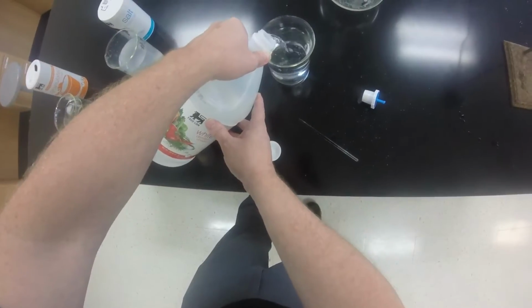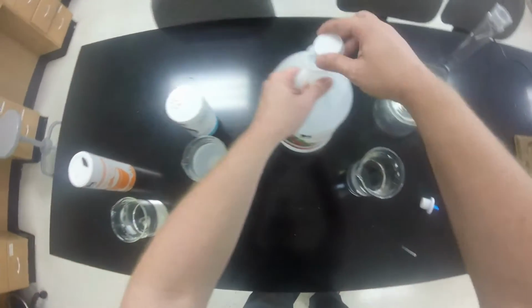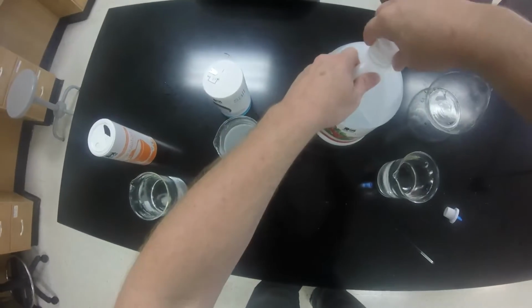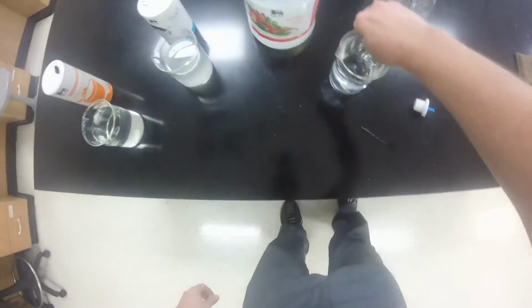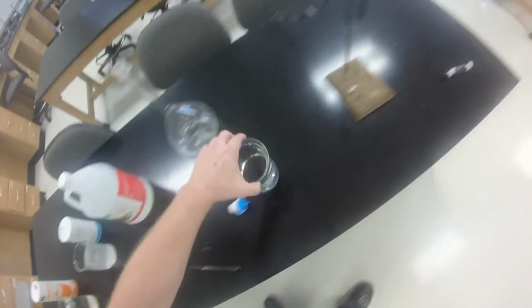So we're going to add some vinegar to our distilled water. So now we have a little bit of this weak electrolyte present. Oh, snafu on the video. Maybe we have to edit. Who knows? We're going to mix it up, and then we're going to put in our electrodes over here.